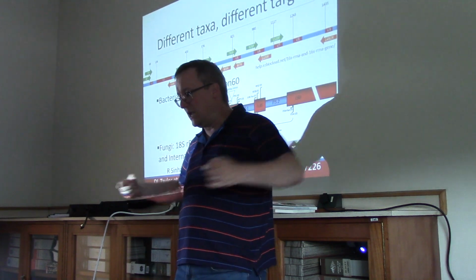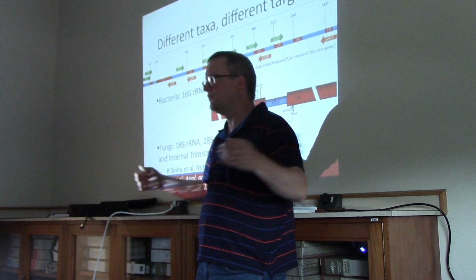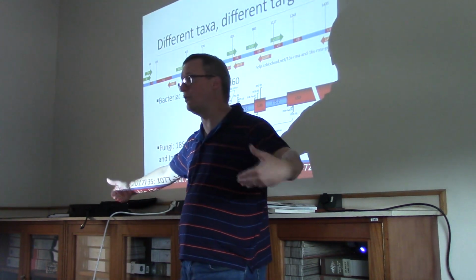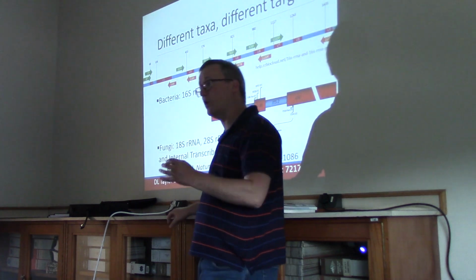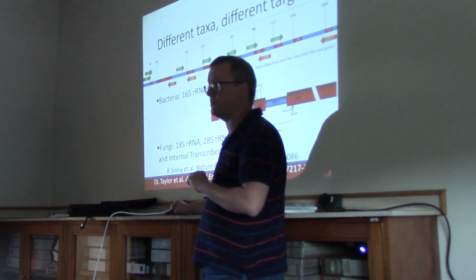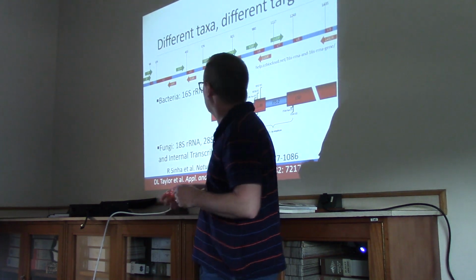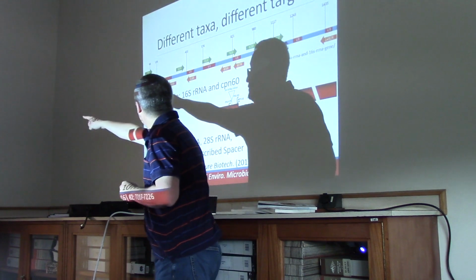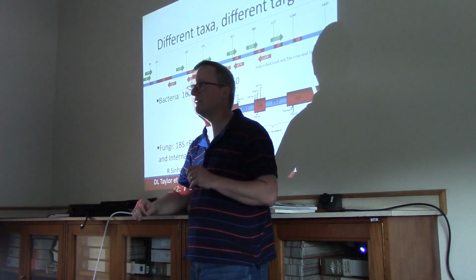If you are able to sequence out a longer region, like PacBio or whatever, you have a little more distance allowable on these segments. And of course, it's quite likely that you're going to be using multiple pairs of primers, creating template DNA for sequencing that covers the V1 region and the V3 region and maybe V4 or something like that.